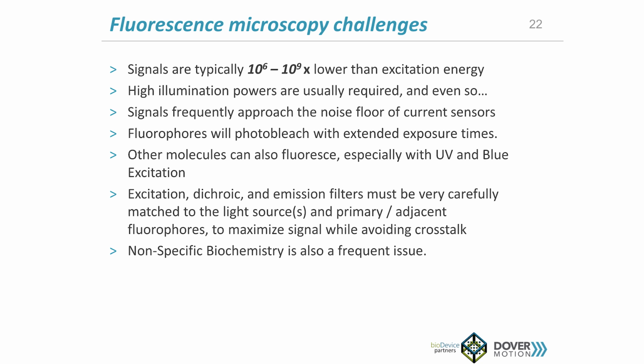Another problem is that other molecules in the sample might fluoresce, particularly under UV or blue excitation. All the filters in the system must be very carefully matched to the light source, whether it be an LED, a laser, or a white light source, such as an arc lamp, and also to other fluorophores that you might want to detect or that might be nearby that you don't want to detect. And you also have to maximize the signal while avoiding crosstalk between the excitation filter and the emission filter. Another problem is that nonspecific biochemistry is also a frequent issue. Fortunately, that's not generally my job to handle.